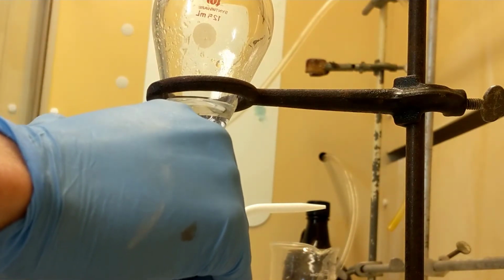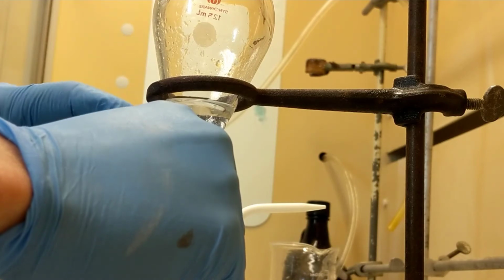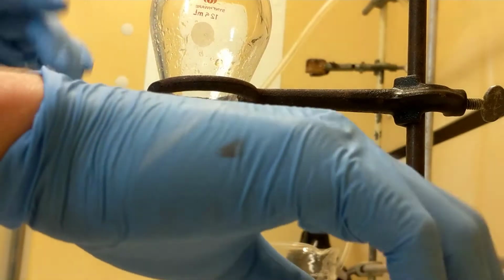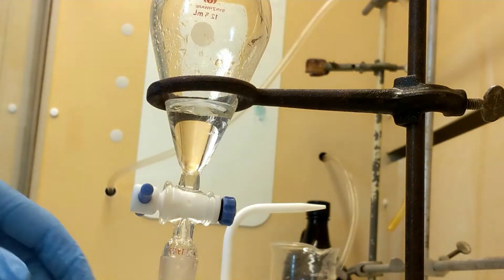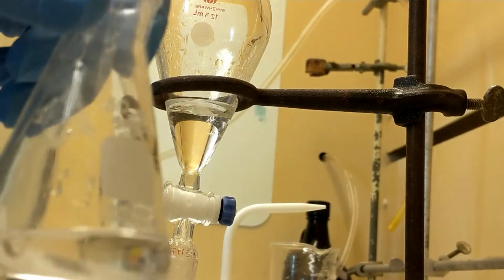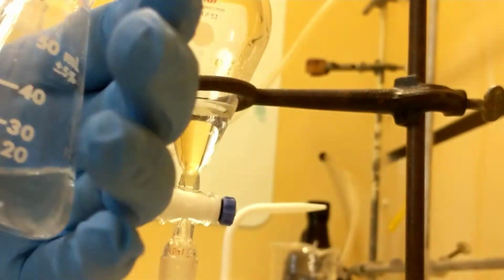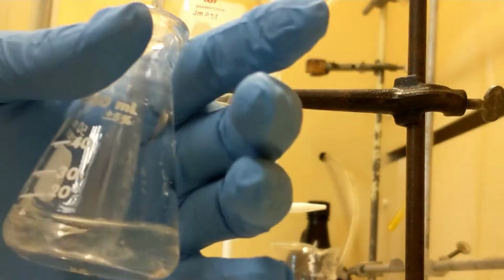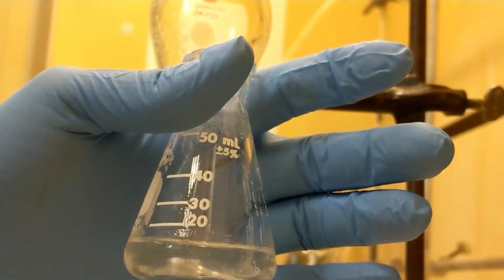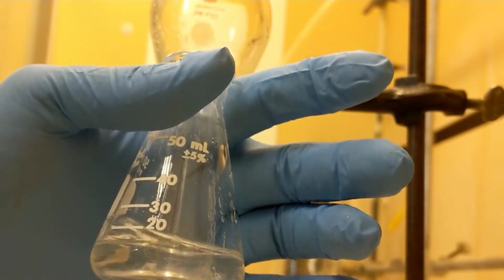Being close, I'm gonna just pull a little bit, make sure I get every drop of the organic. Up and close. Alright, now if you look at this funnel, you can see there's no lines in it, which means I got all of it out. But if you look right here, let me show you the methylene chloride, caffeine. If you see it right there, you see there's just a little bit of layering. It looks like I got just a little bit of water. Perfectly fine. I'm going to dry it in a second.